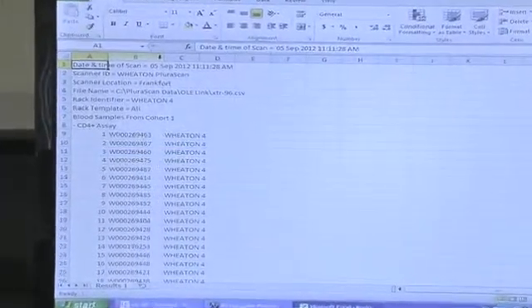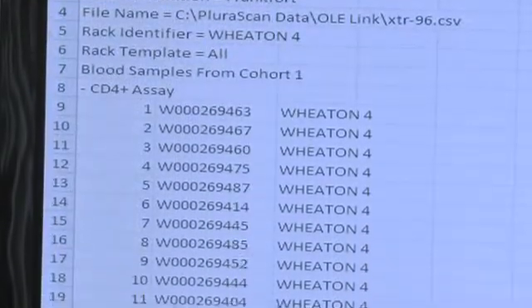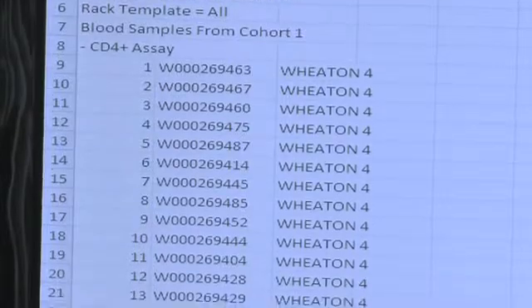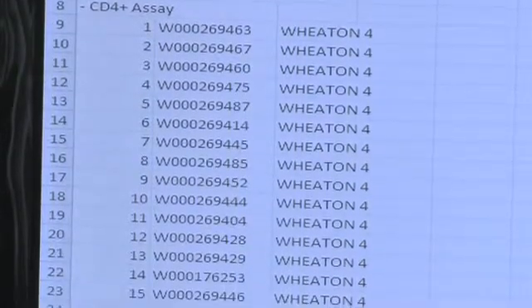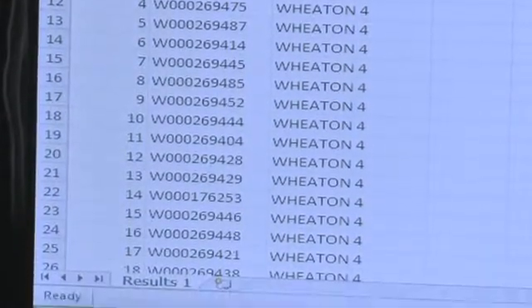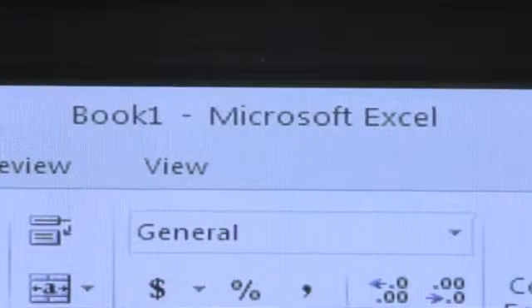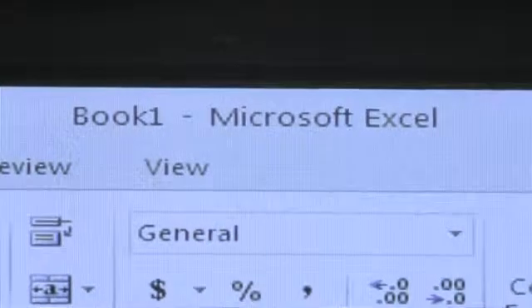The results of the scan are now captured in customized CSV formats, directly imported into your LIMS or database, or easily exported and opened in Microsoft Excel as shown here.